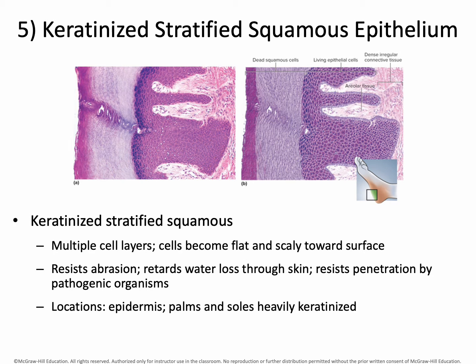As you see those cells go from that very dark purple line to a light staining area, where you see it at the surface, it's dark purple. That is your free surface. That is the surface of our skin, and that is the keratinized cells.